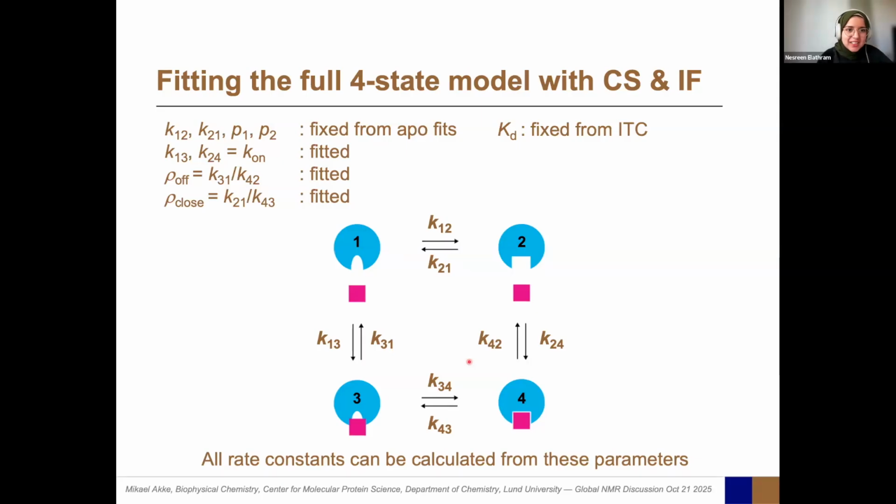Okay, cool. Hopefully this answered the question. We have another question. Is it correct to assume that the K-on is the same for both free states, only in the particular case of galectin 3, where the conformation of the free and bound states are the same? Yeah, sorry. Were they the same or no?